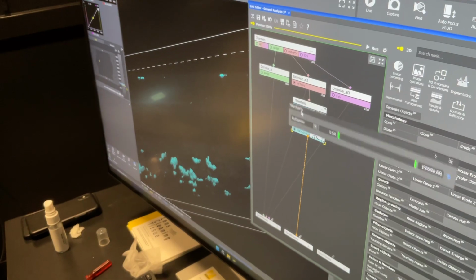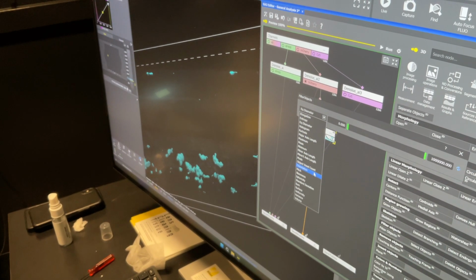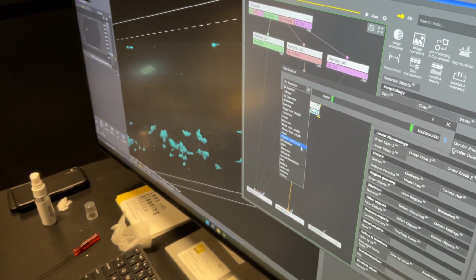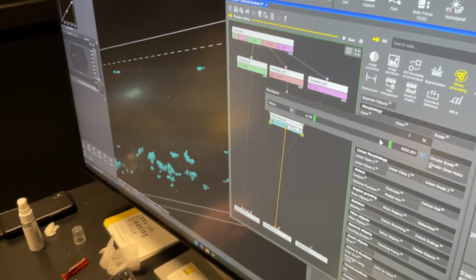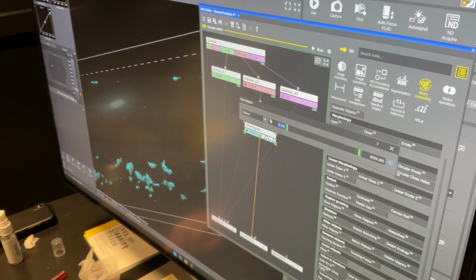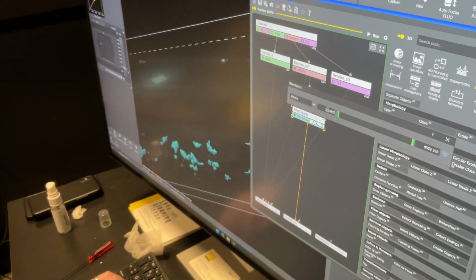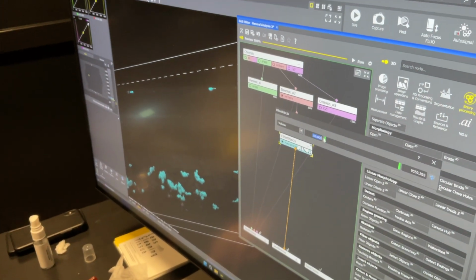So I'm going to go into my settings here, and now I'm going to pick, let's do object. Normally I do object area, but now we're in volume, so you could do volume or diameter. Volume right there. Things are in different spots to where I'm used to. Now I could use these, but I tend to like to type in. So let's do like 200, and we'll see what happens. Maybe too aggressive. Let's go with 100. That looks pretty good. Stuff's coming back. Let's try 50.